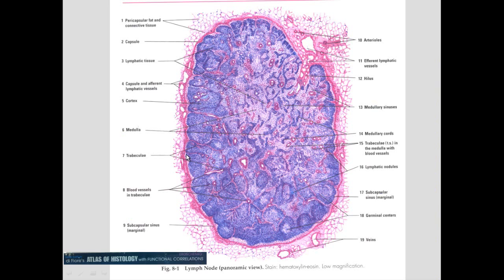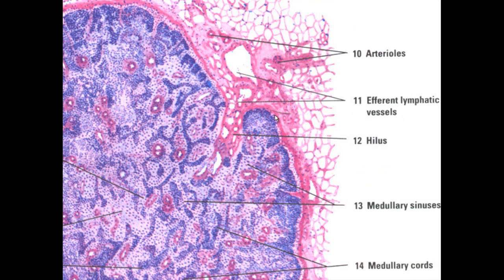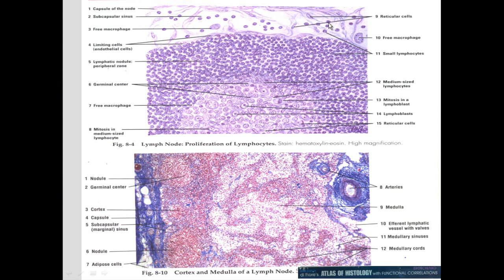Another organ is the lymph node, which has a capsule, a series of follicles on the outside forming the cortex, and a medulla. At higher magnification you can see medullary sinuses — fluid-filled lymph sinuses — and medullary cords. Between the cords the lymph fluid flows through. Just inside the capsule is the subcapsular sinus. We can see the subcapsular sinus, follicles with germinal centers, the cortex, medulla with medullary cords and sinuses, and blood vessels running through.